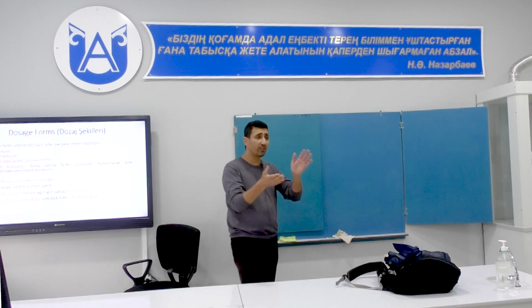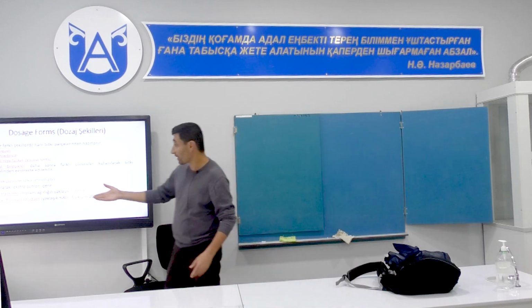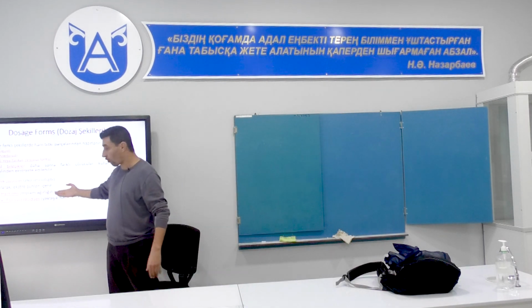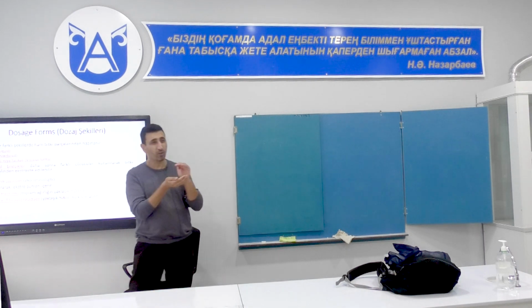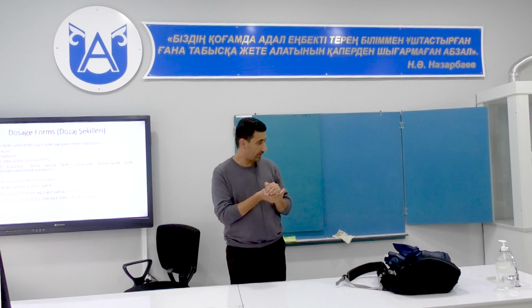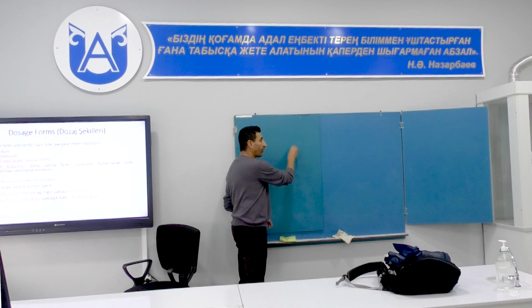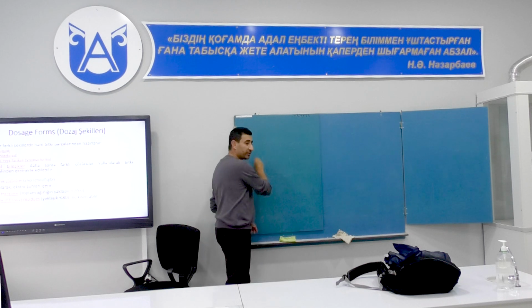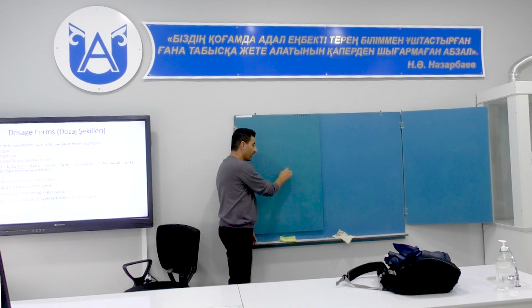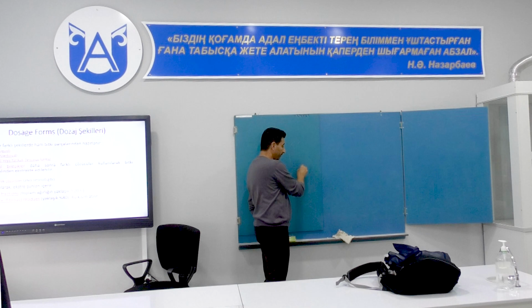When we are trying to do a plant extract, generally it will be the extract in two forms. There will be a soluble part and an insoluble part. Let me show you. Look, I bring some plants and put them here. These plants will be here, plant materials, and the solvent. For example, this is ethanol.